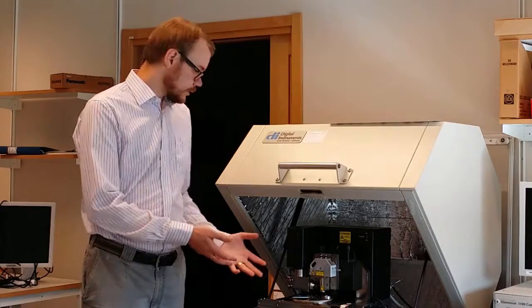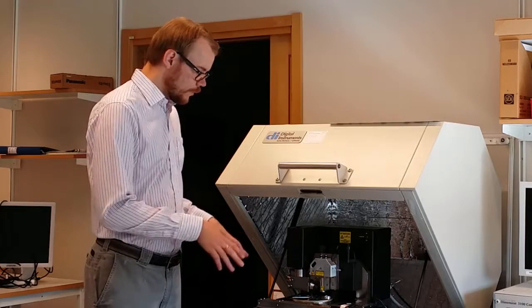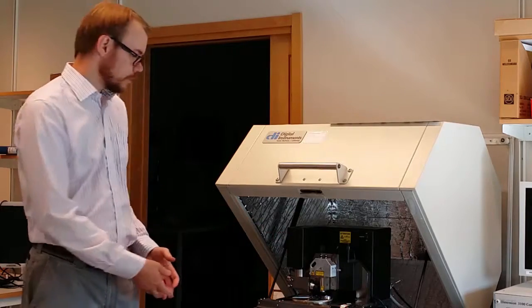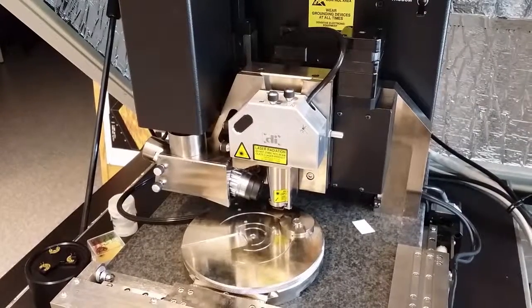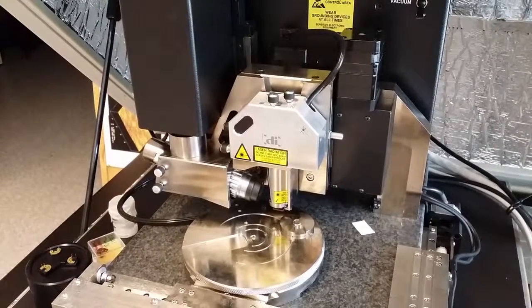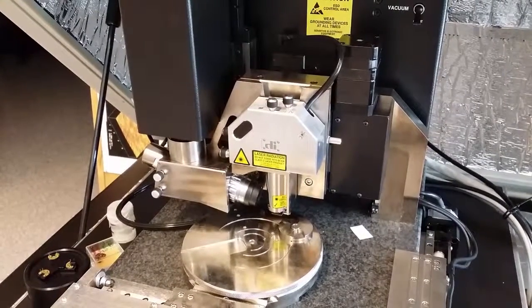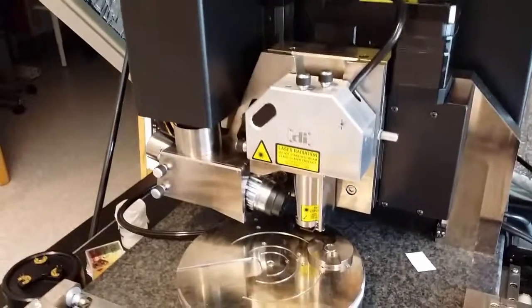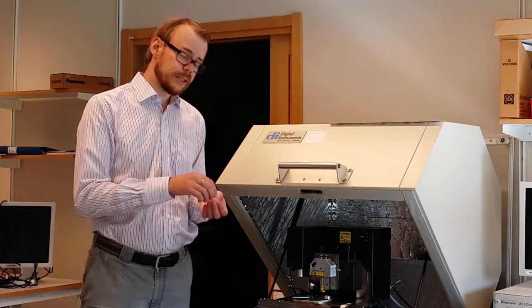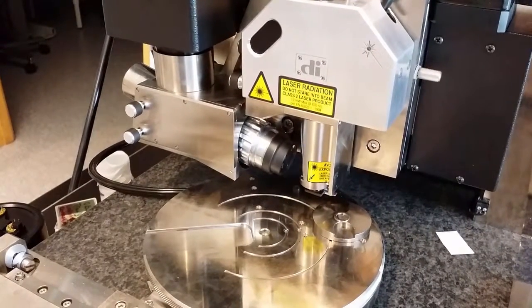The machine consists of basically three things. First, there is this vibration unit that controls and removes all vibration. Then there is a coarse motion stage to move the sample around in an XY direction. Then the third thing is the scan head. The scanning head is a piezoelectric machine that by piezoelectric forces can scan across the surface with the tip.